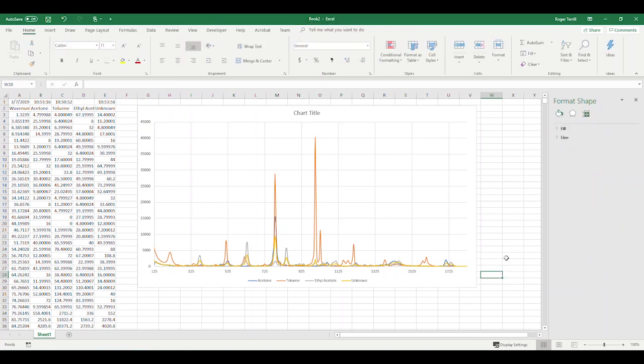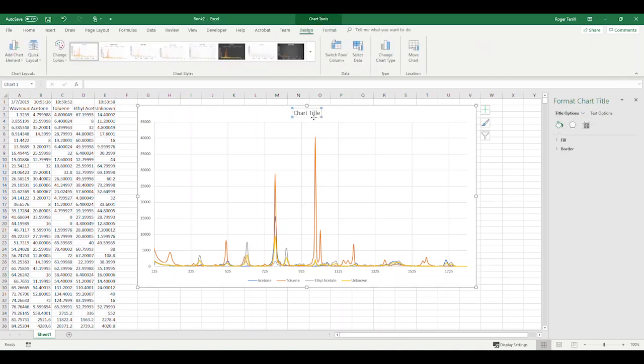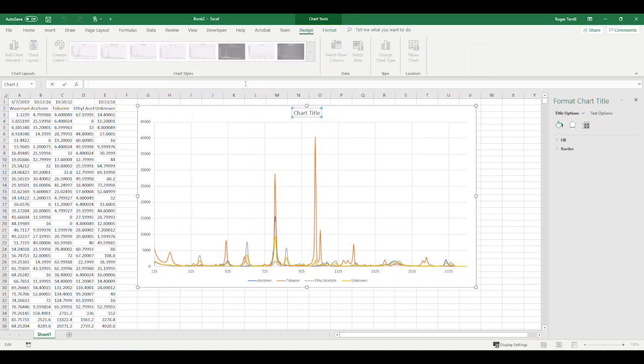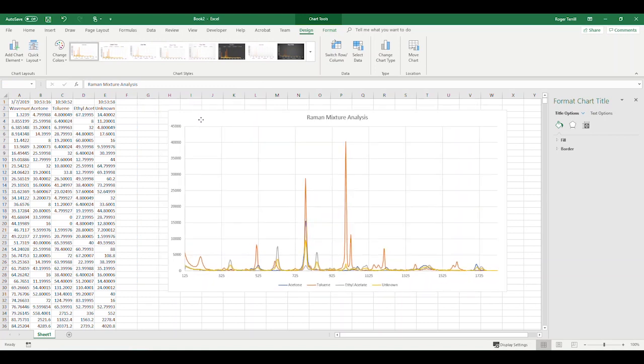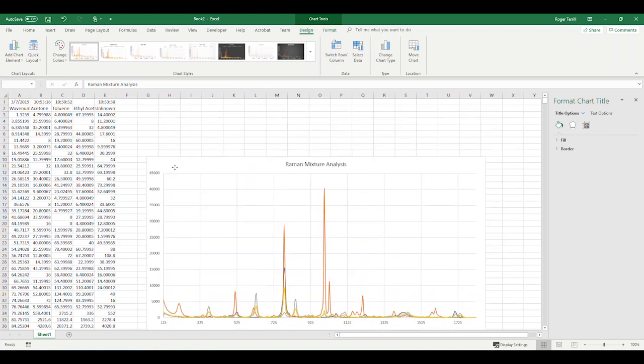Let's see now. I still don't know if I was to get known. Toluene and unknown look pretty similar there, but oh well. So the title we'll write here is Raman Mixture Analysis. We'll leave that there for the moment.